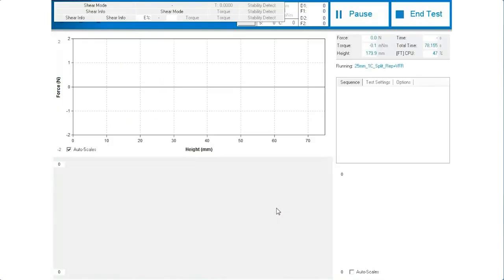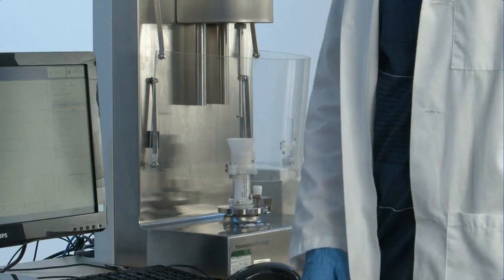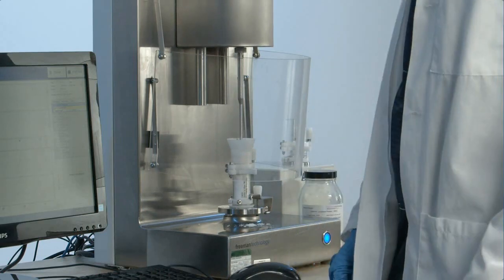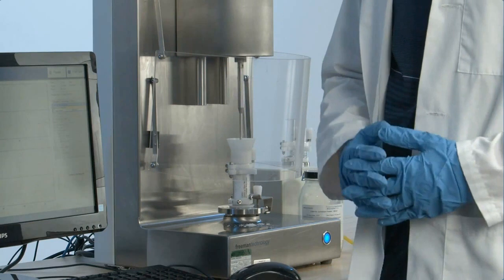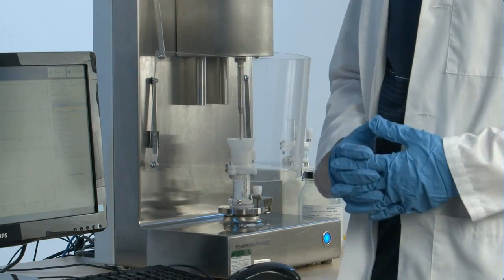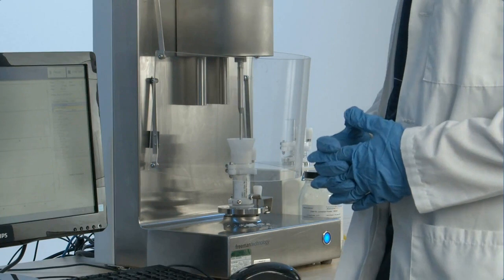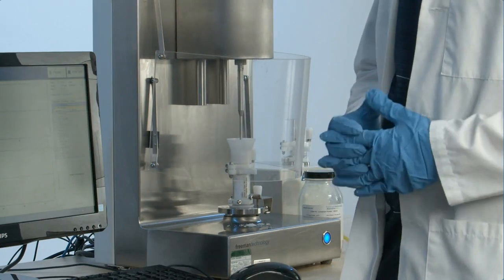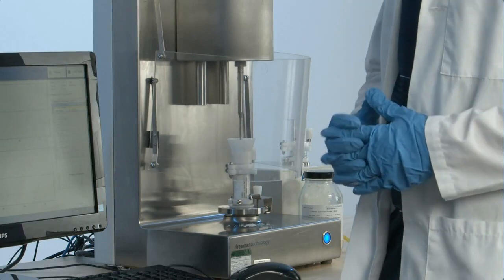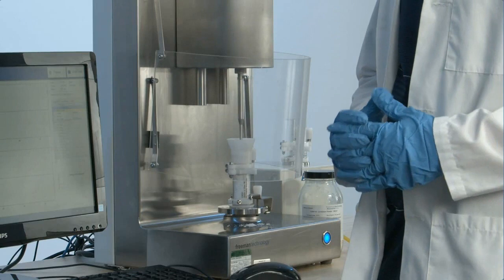At this point, we're going to be running the conditioning step, which I mentioned before. The reason why we run the conditioning step is because powders are very sensitive to their individual packing states, and the properties that we record of a powder's flowability are going to depend heavily on a given packing state. So it's very important that we have a nice homogeneous, evenly dispersed, loosely packed structure before we record any measurements that are done in the test.